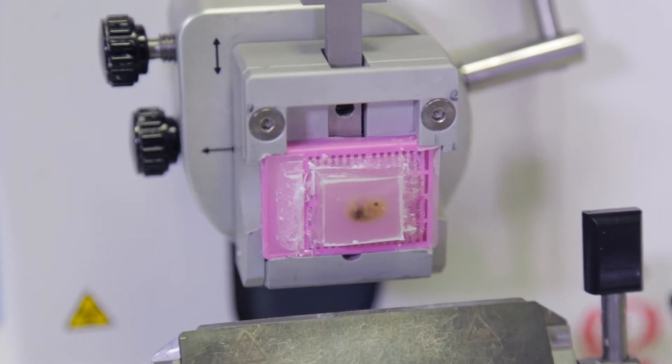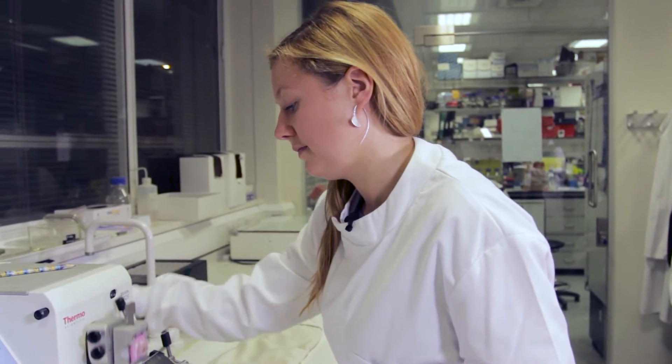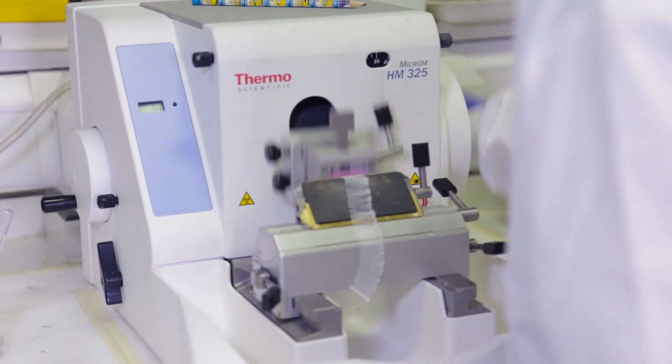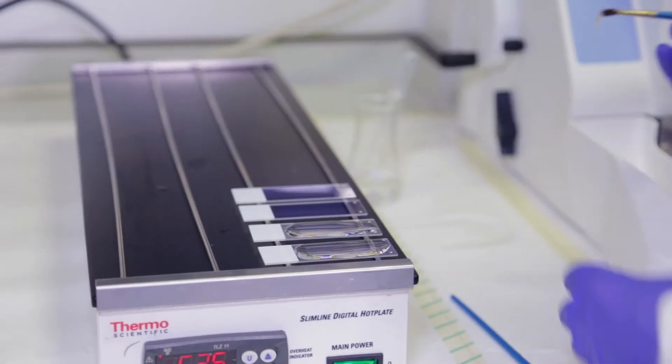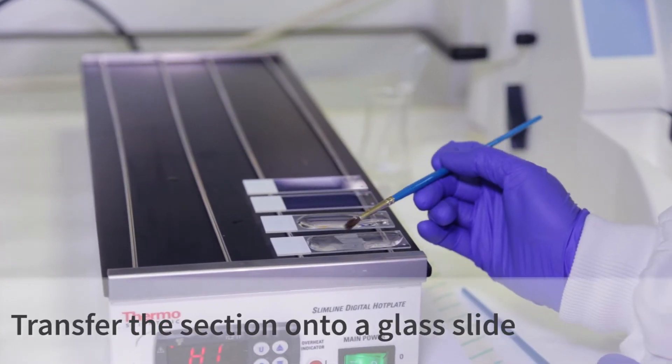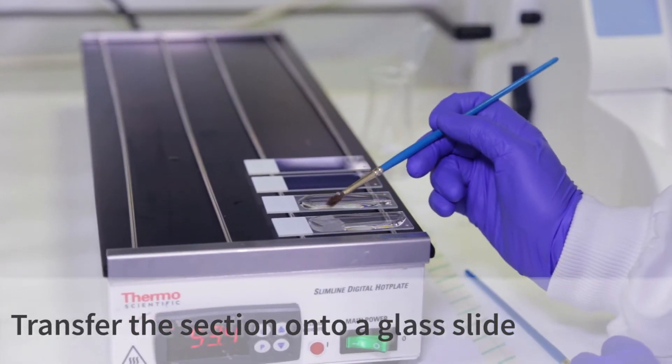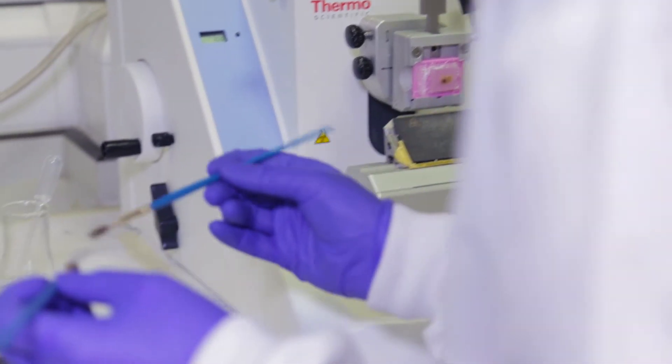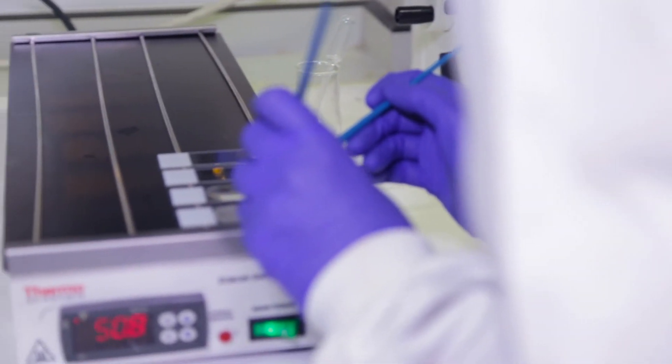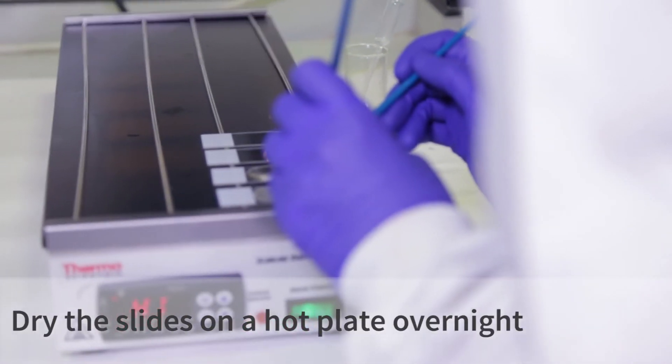A microtome is used to cut tissue that has been embedded in paraffin wax. I cut my sections at 7 microns thick. The sections are placed on glass slides that have had water pipetted onto them. The slides are heated on a hot plate. The slides are left on the hot plate until the water has dried and the sections are attached to the slide.